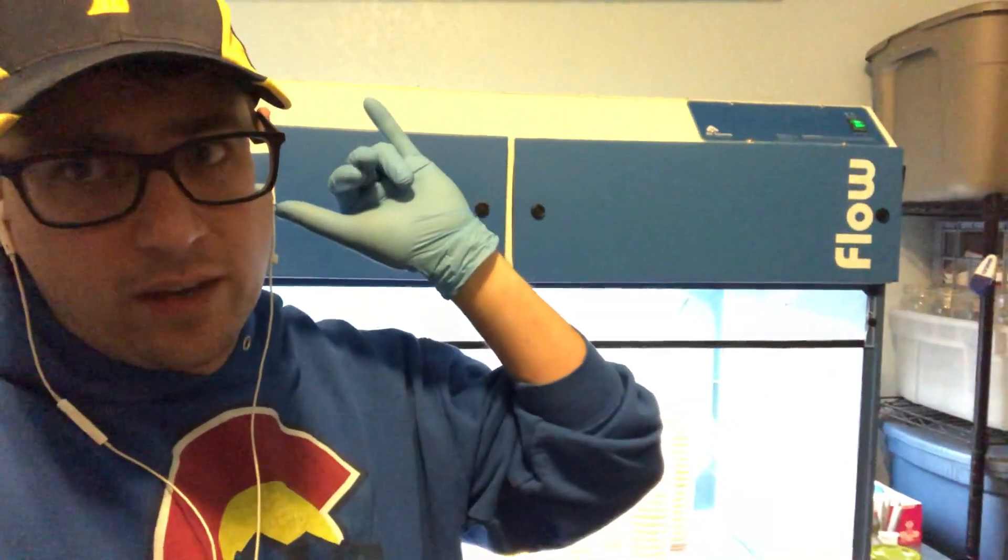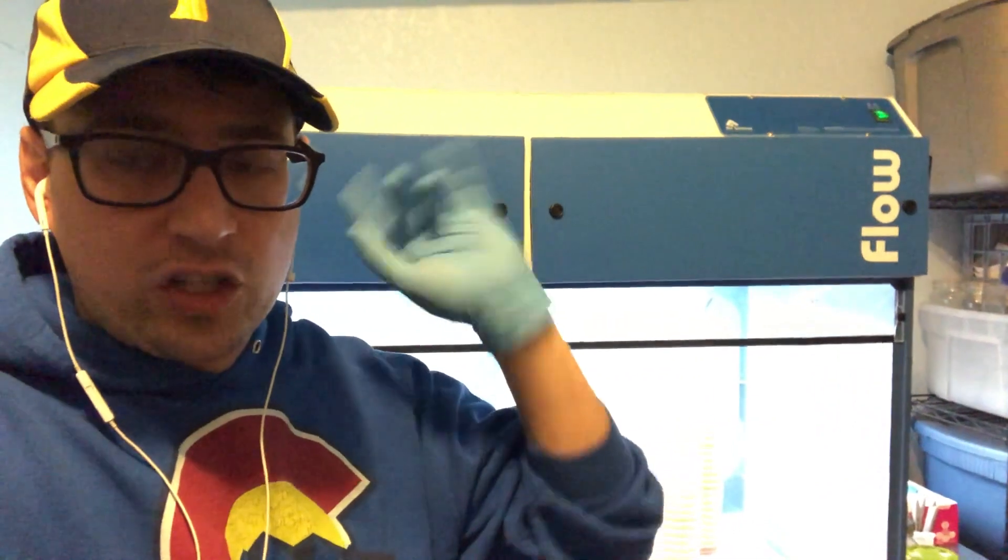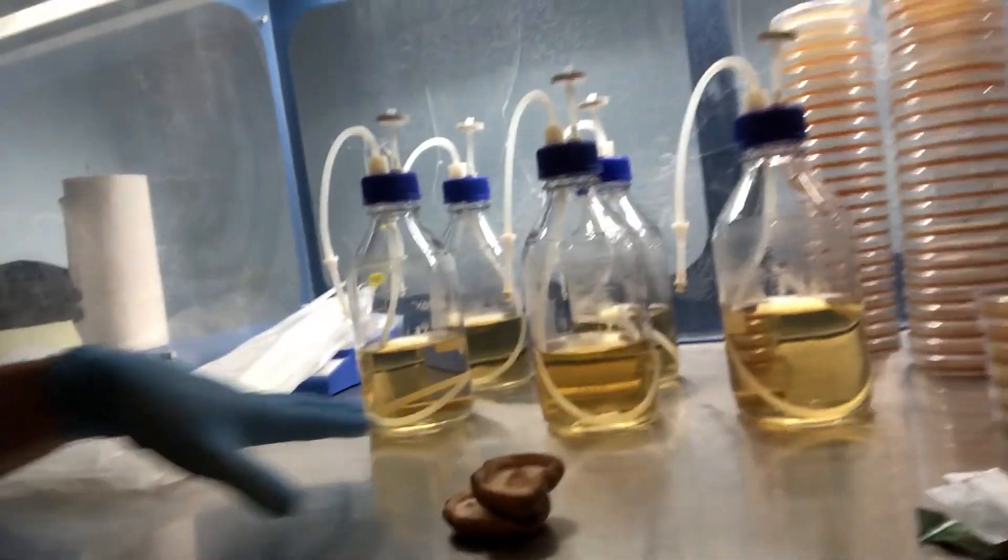I'll keep everyone posted on how these are growing out, and hopefully, keeping our fingers crossed, we get some clean mycelium. Then we'll be posting those on our Etsy along with the morel mycelium and the chanterelle. So there'll be probably a three-pack of mycorrhizal species out this fall. I'm working on it. I've got a bunch of liquid cultures and another shiitake that I'm gonna be cloning.